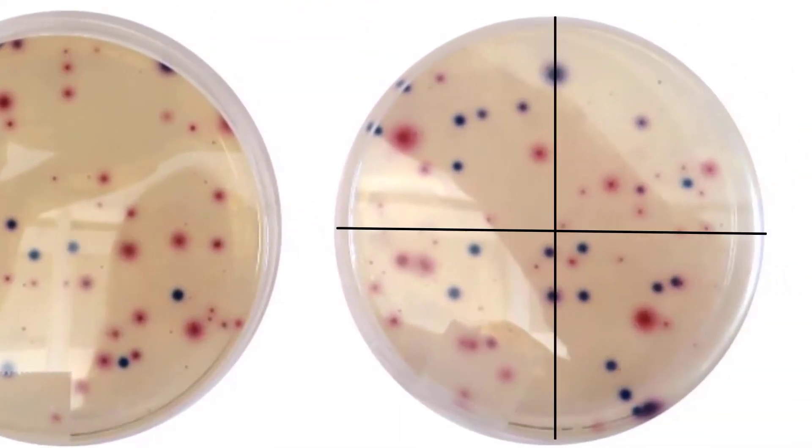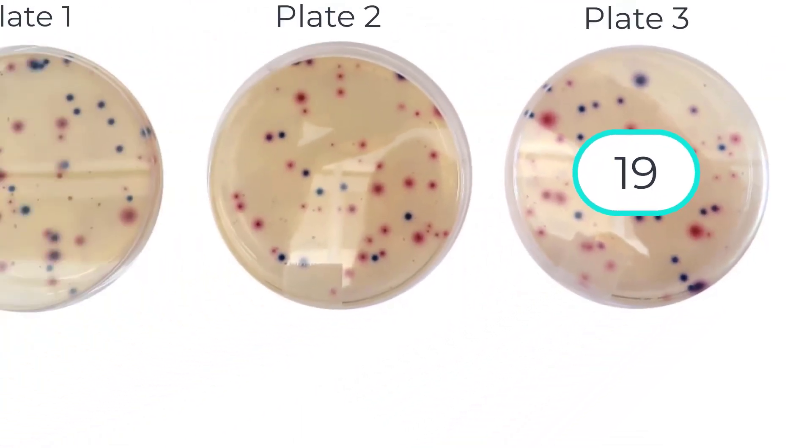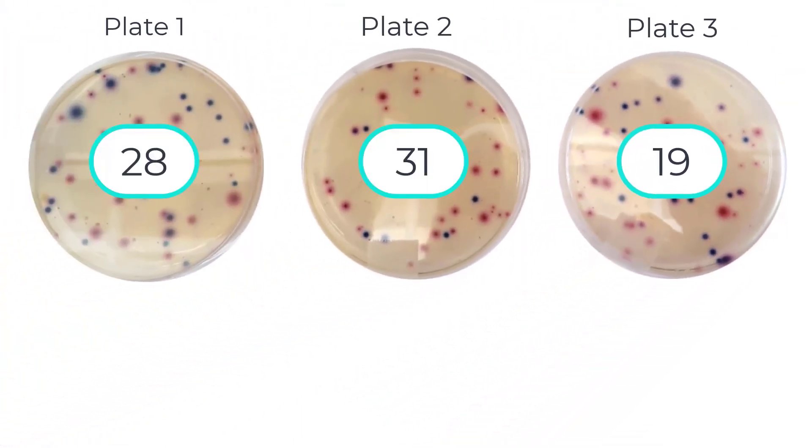Finally, our last plate. Counting the other coliform colonies on plate 3 together: 1 through 19. There are 19 other coliform colonies on this plate.